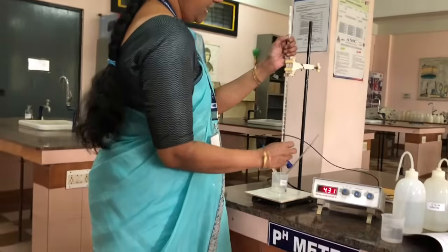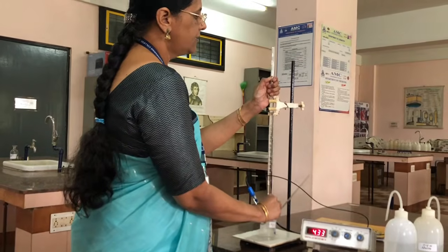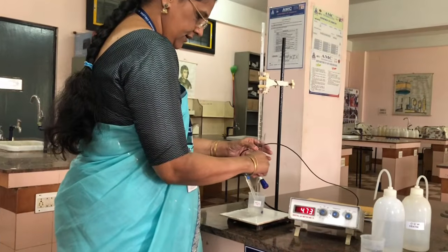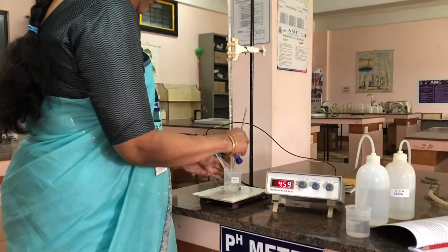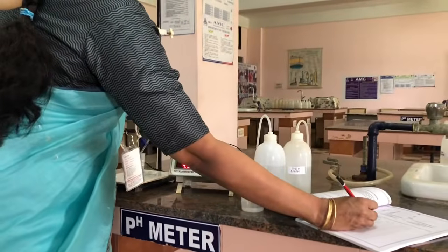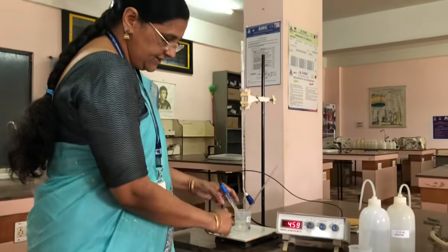Now again you have to add from 1 to 1.5 ml. Again after addition of 0.5 ml, you have to shake the solution and note down the pH. You will observe that with the addition of 0.5 ml continuously, the pH of the solution is increasing because the H plus ion concentration is decreasing in the solution.